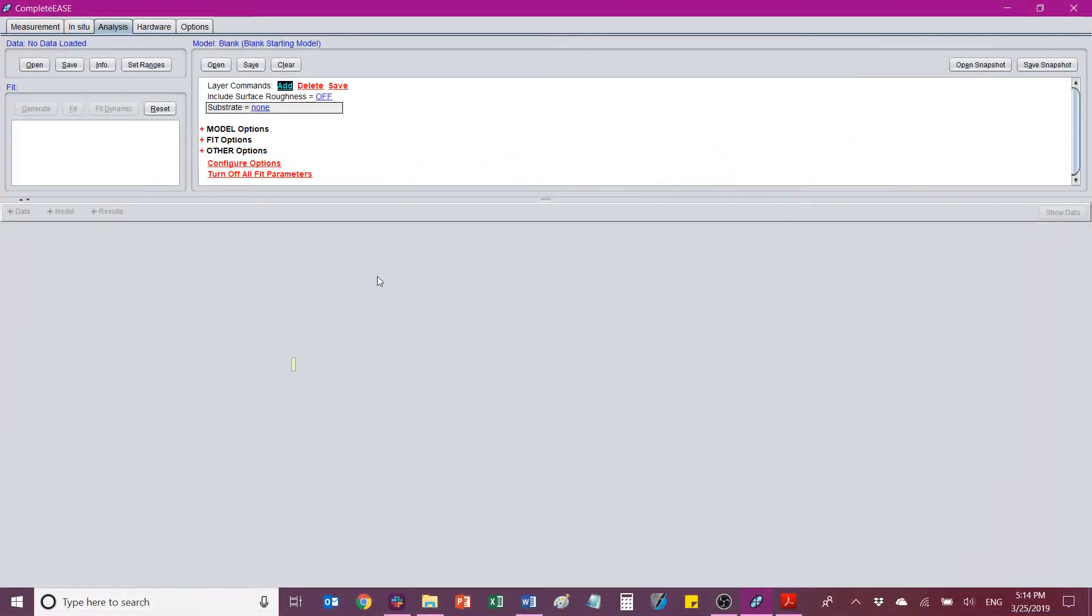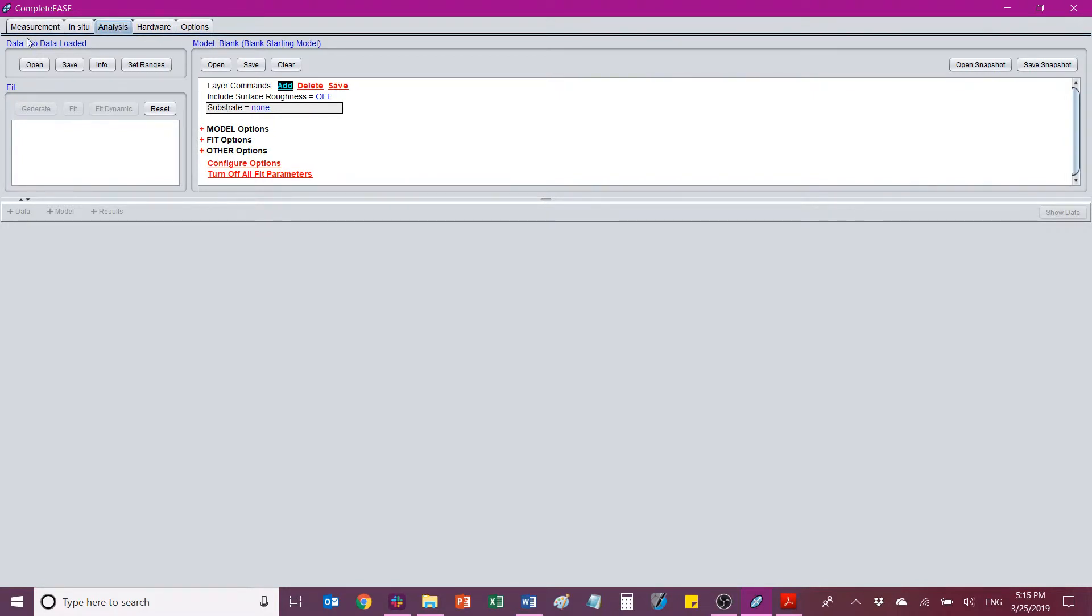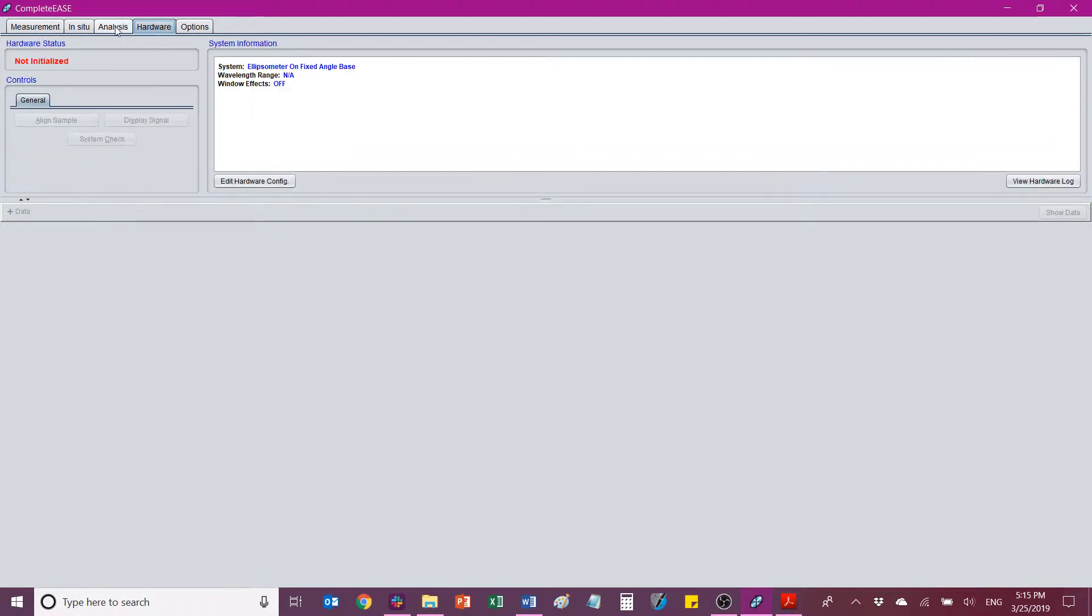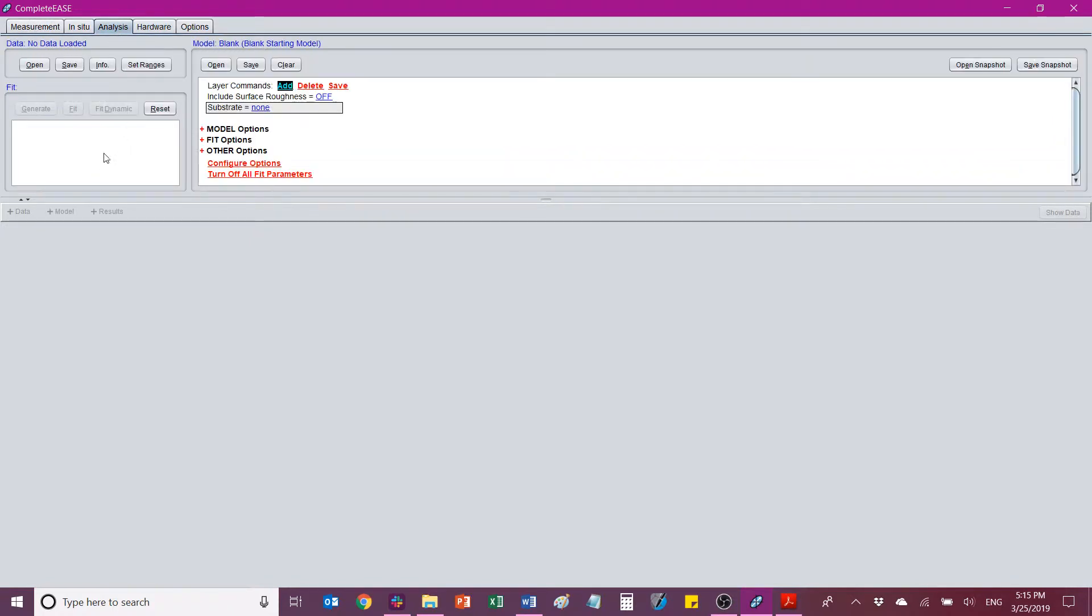So when you open up the Complete Ease software, you'll find that there's a number of tabs along the top. The one we're going to focus on right now is the Analysis tab. There will be some things that you'll have to do in the measurement and hardware tabs, but that's best shown in person when you're actually working on a working tool. If we go to the Analysis tab, you'll see there are a few different sections of it.